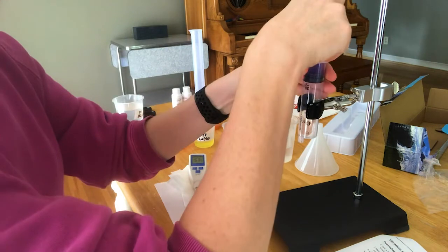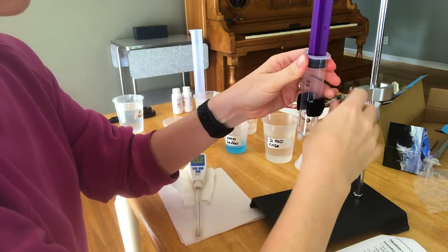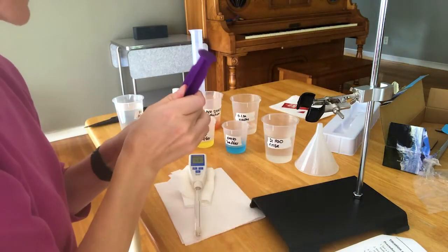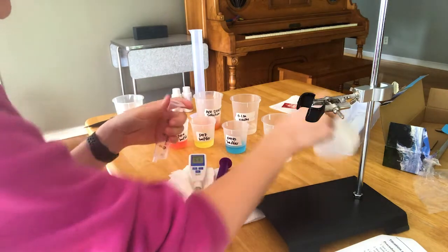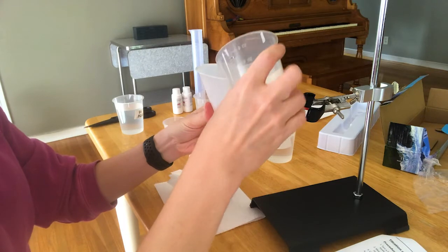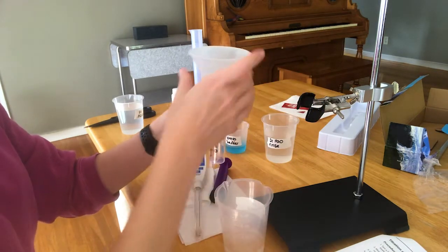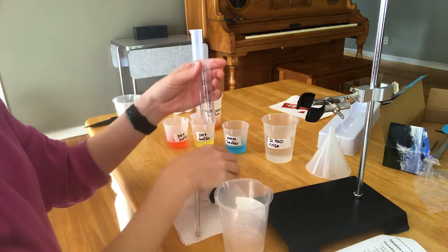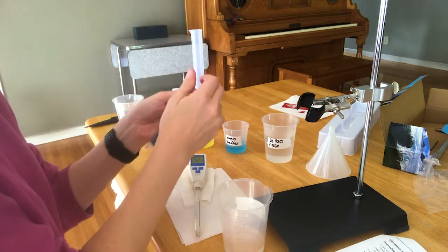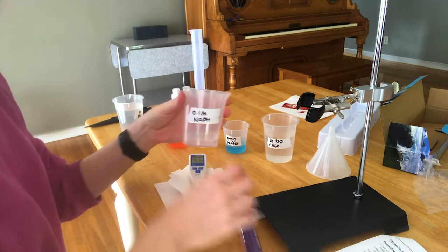They say to pour it using the funnel into this syringe, and that did not sound like a good idea to me. In the beginning I was thinking maybe I'll try it and follow the instructions, but then I decided no, that doesn't sound like a good idea. So instead, I didn't use the funnel at all.